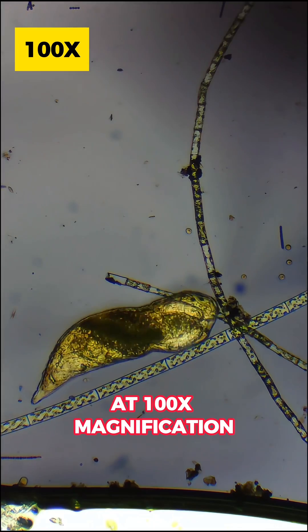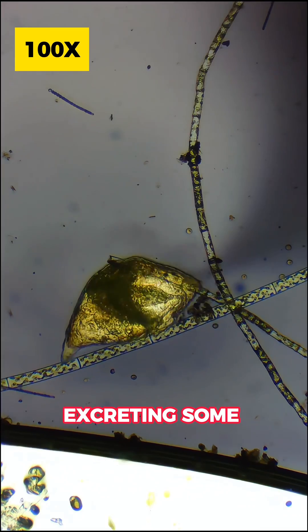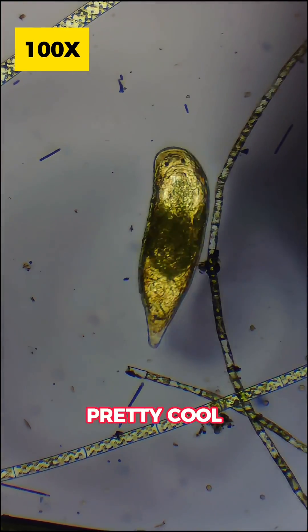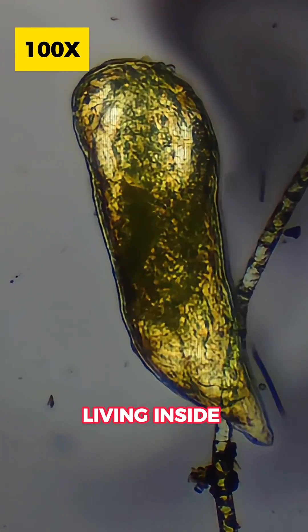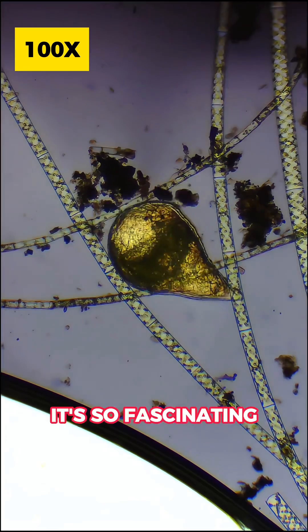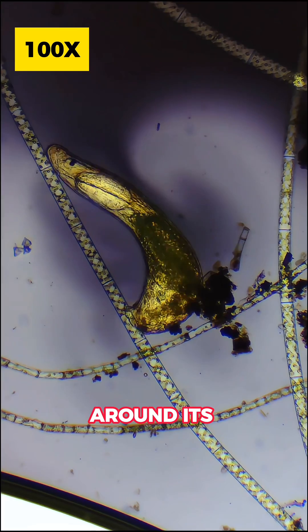At 100x magnification, you can see this rotifer doing its own thing. I noticed it excreting some type of matter, which was pretty cool to watch. You definitely don't want this organism living inside your body. It's so fascinating how this organism contracts and protracts to move around its environment.